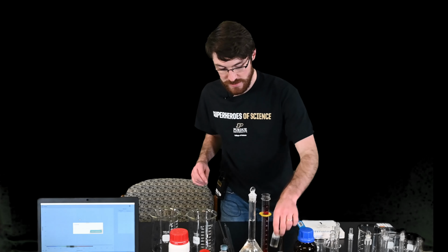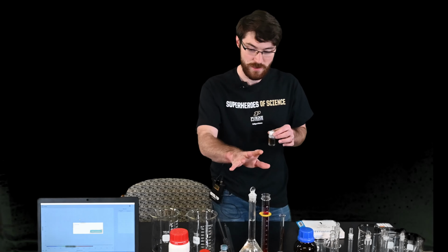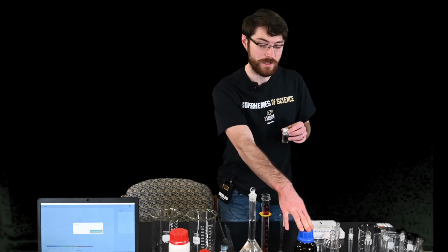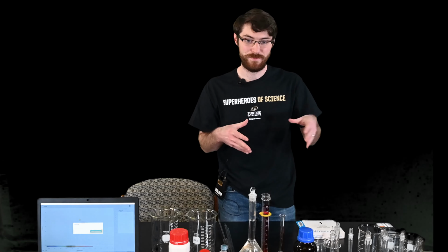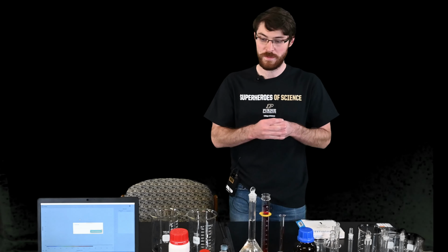The last thing we will need is sulfuric acid. That will be used in the preparation of both of these solutions, as well as in the treatment of our water sample to help digest any iron hydroxides and prevent basic conditions which tend to precipitate iron. We want to keep all of the iron in solution.